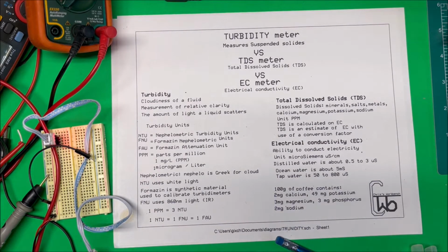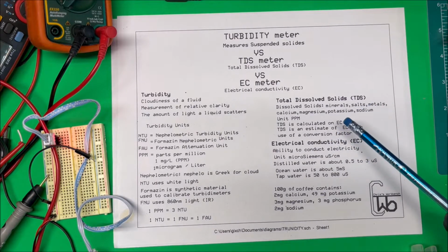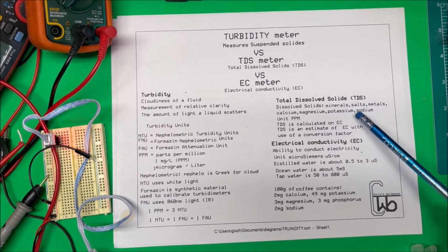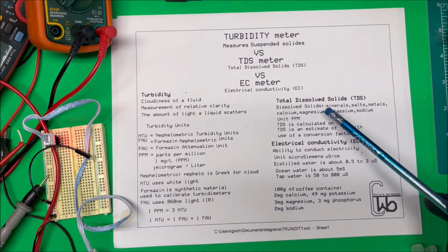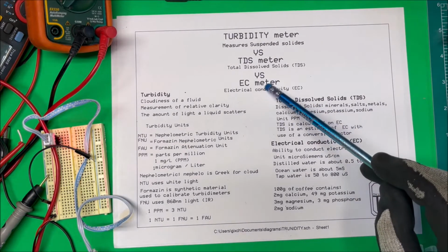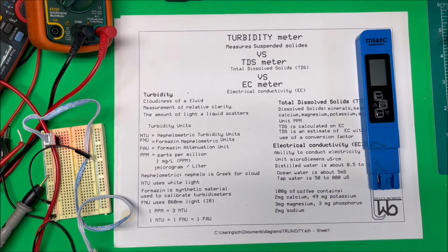Now, a TDS meter measures the dissolved solids in parts per million. Okay, so dissolved solids would be minerals, salts, metals, calcium, magnesium, potassium, sodium. Now, the liquid can be clear, but it'll have these dissolved solids in there. And the TDS is calculated from the EC. So here's a meter here. It's a TDS meter, but it's basically an EC meter.